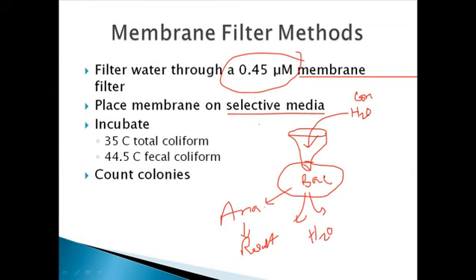If we add a medium which supports the growth of only coliforms but no other microorganisms, then the coliforms will grow on the agar plate really rapidly, and from them we can determine whether the water sample we have examined contains any coliform or pathogenic content or not. We do not select this media to grow pathogens, because this is hard and really dangerous to work with pathogens in laboratory situations. It needs expertise, it needs very tough technology.